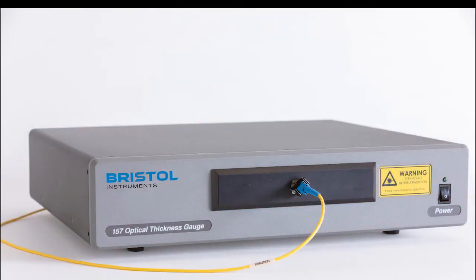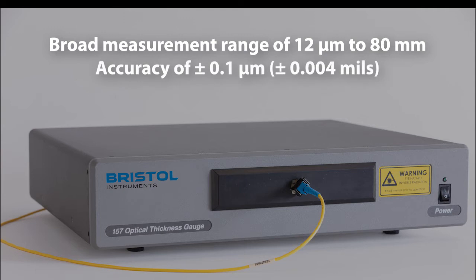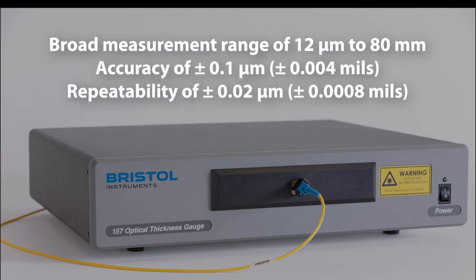These precision instruments measure a broad range of transparent and semi-transparent materials with reliable accuracy and exceptional repeatability.